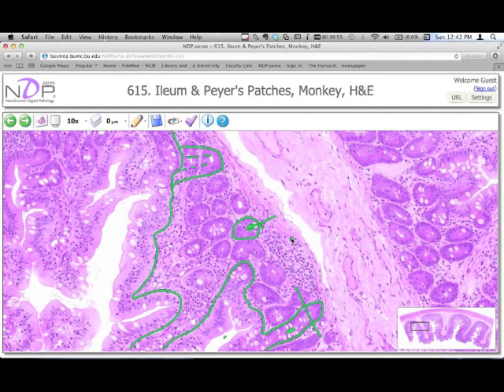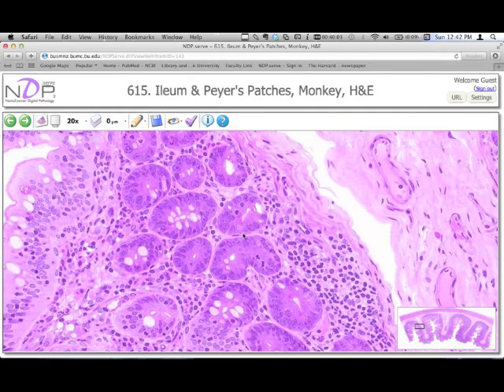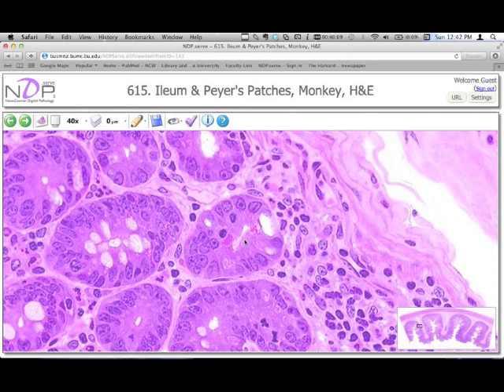So why is this important? Well, it's important because if we want to identify whether a cell is a mast cell or an eosinophil, we have to consider the fact that both of those cells are in connective tissue. And we have to control against the possibility that what we're looking at is not actually connective tissue. And so these cells, in fact, are what are known as Paneth cells, and we'll learn about those later in the course.